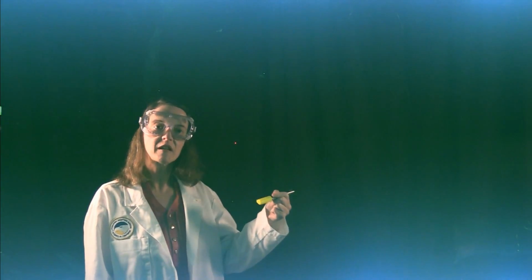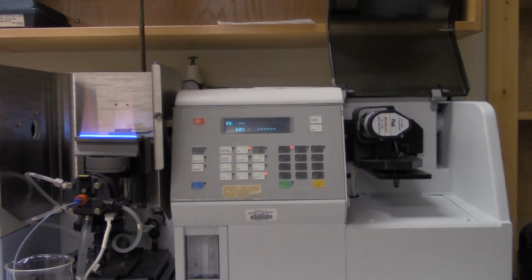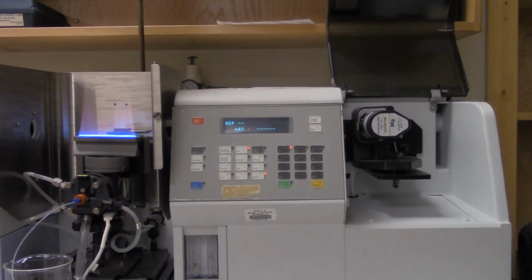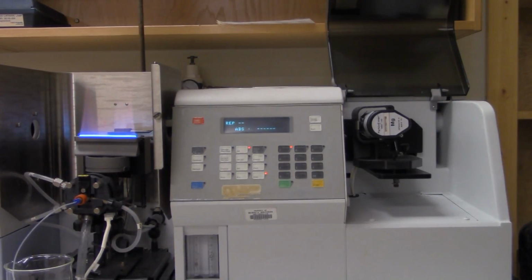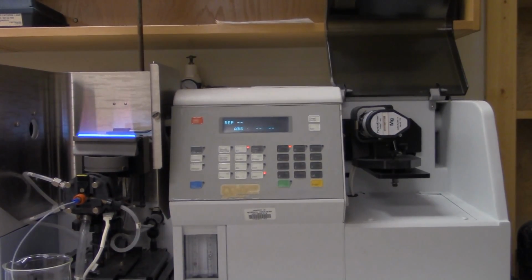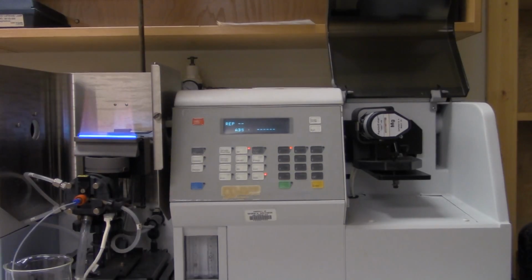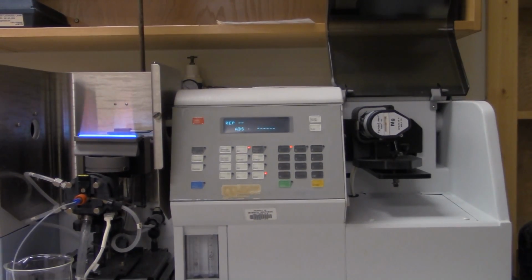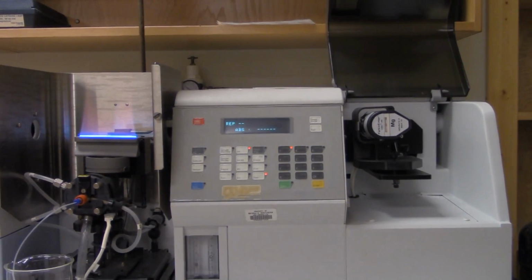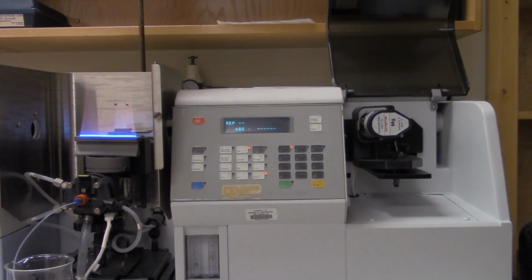Well, the atomic absorption spectrometer has a lamp on one side, and let's assume we're looking at the calcium instrument here. The lamp will be filled with calcium vapor. Electricity is run through the lamp so that the ground state of calcium atoms will absorb the electricity and go to the excited state, and then the electrons will fall back to the ground state and emit the light that you see glowing from the calcium lamp.